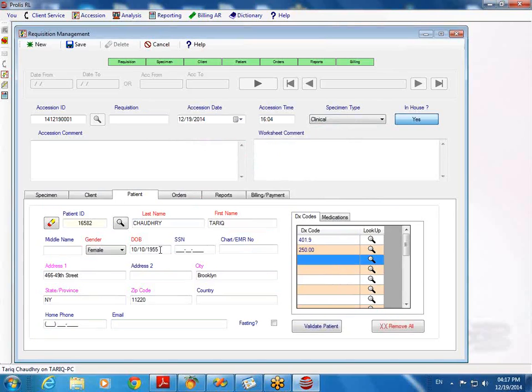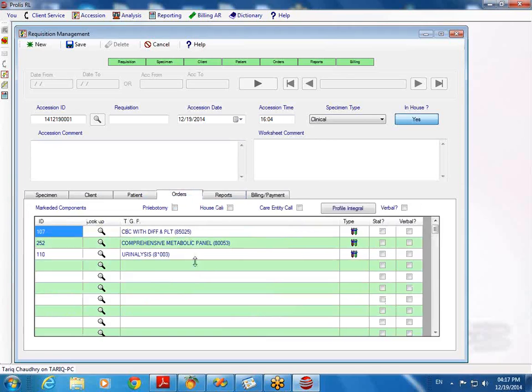So it's more than 55 years old, and the filters on the test are up to 50 years. So that's why these kind of internal filters are applied on the test if the laboratory wants it. These are kind of the errors your system can provide you the capability to avoid.